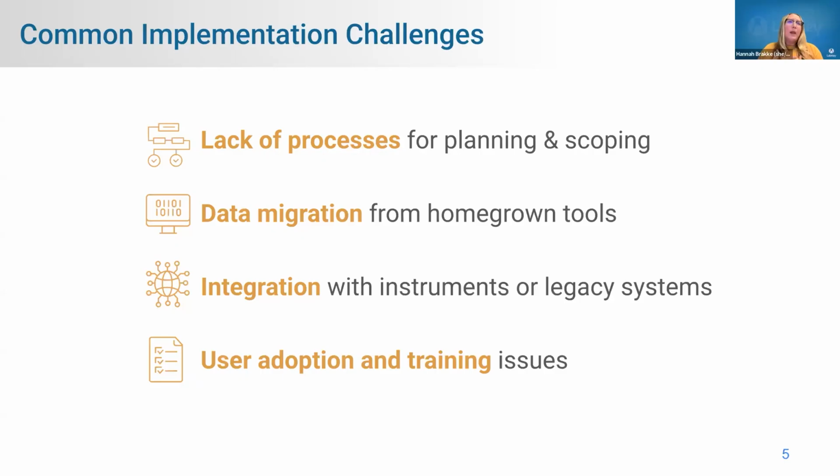Integration with other instruments, or legacy systems, or other systems, tends to be another sort of hurdle that people are facing. Again, if there's not a clear directive in what that integration should look like, or what exactly it should do, right? Is it a one-way integration? Is it two-way? Are there other systems that we need to keep in mind? That can also drastically slow implementations down.